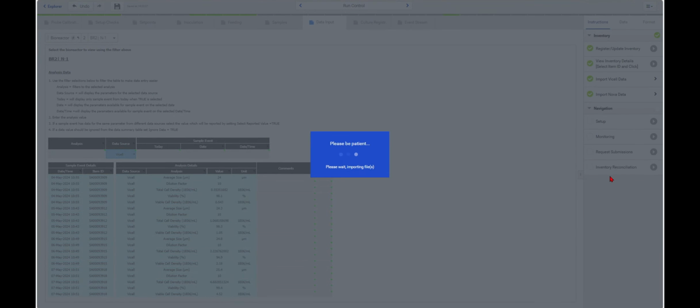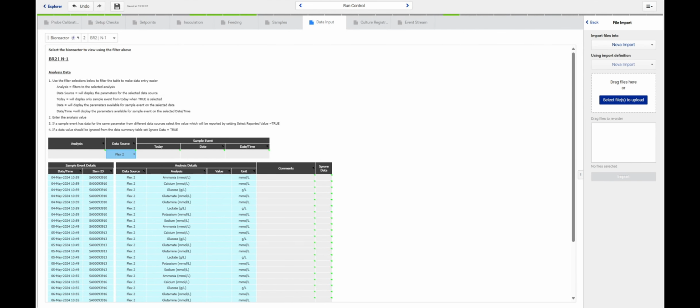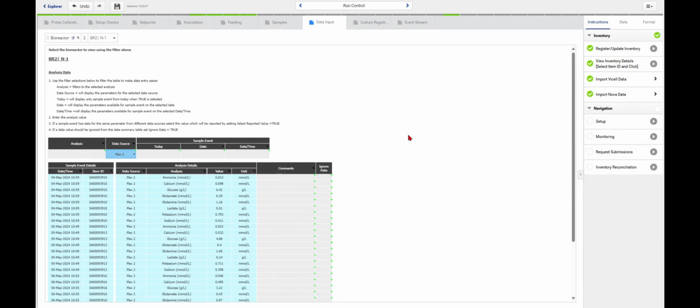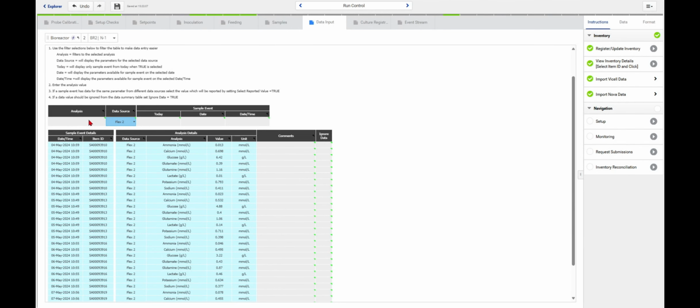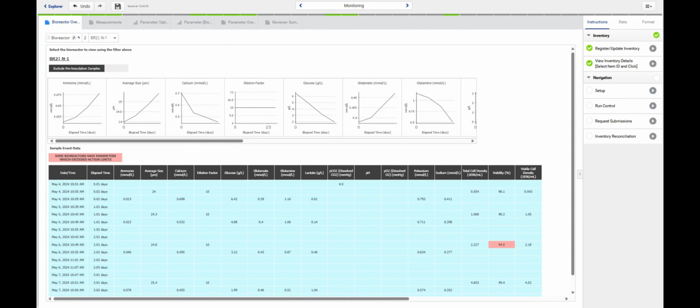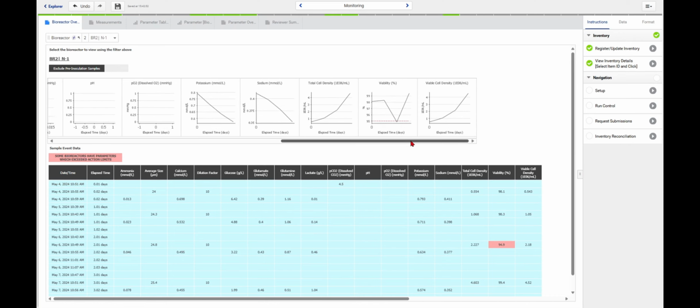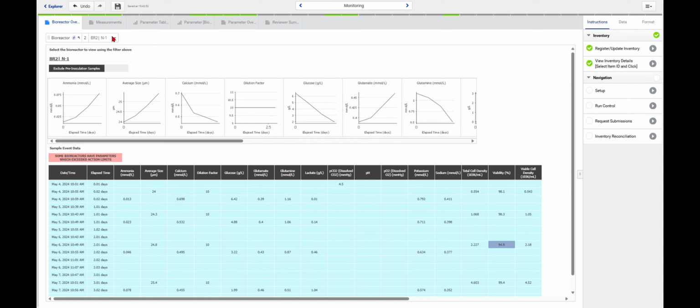At the same time, Polar validates those incoming results against predefined criteria and even allows me to filter them so that I can focus on the exact parameters I need to monitor for this step. Capture. As results come in, Polar checks them against defined limits and lets me visually track them in real time, instantly flagging anything out of range so I can respond immediately.